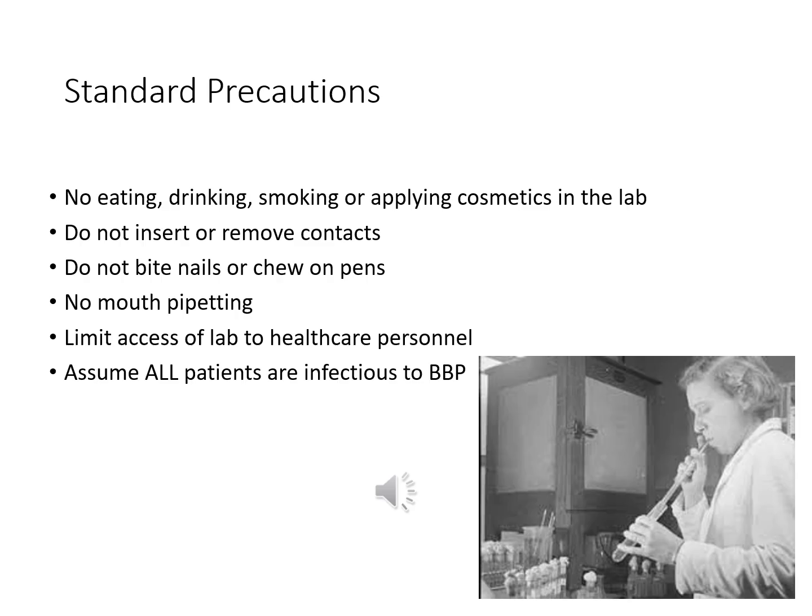And then make sure to limit access to the lab to only essential people who actually need to be in there, for the safety of you, patients, and visitors in the hospital. And make sure to assume, again, that all patients are infectious for bloodborne pathogens.